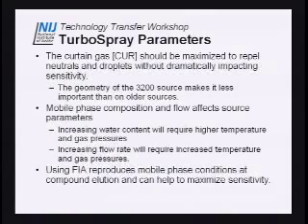Mobile phase composition and flow rates affect the source parameters. Remember, we talked about yesterday, if you increase the water content, this will require a higher temperature and gas pressures. Water is a little bit less volatile than methanol, so you have to increase the temperature in order to get more ion production. If you're running a system like ours, we start out at 95% water and we end up with 95% methanol. So we set the temperature so that we're dealing with that water at the beginning, and then at the end the methanol is just evaporating quickly.